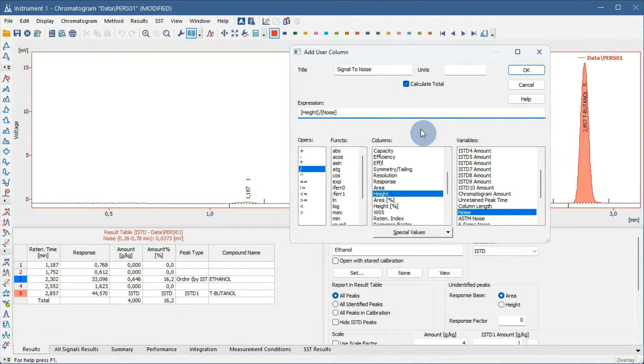Uncheck Calculate Toll as it is not necessary. Click OK to save it.